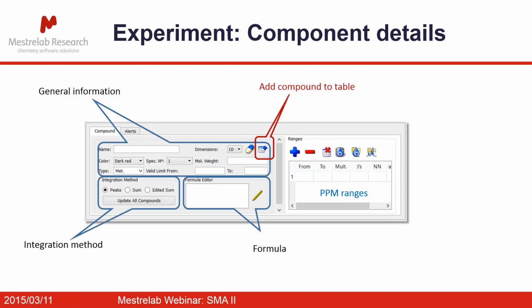Okay, and lastly, this is quite an important button. Once you've filled in all the information over here, when you are ready to add that to the table for the first time, you must click on that button over there. Otherwise, you stand to possibly lose your data and have to put it all in again. So don't forget that add to table button.